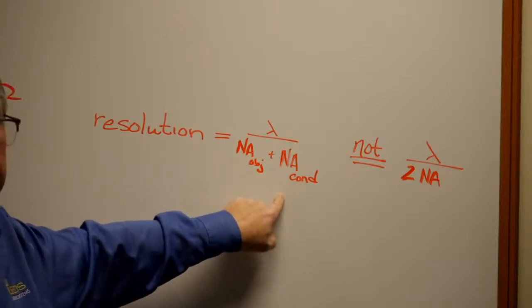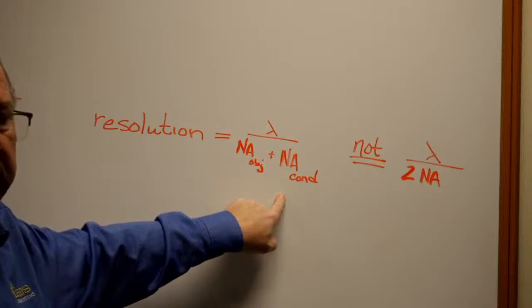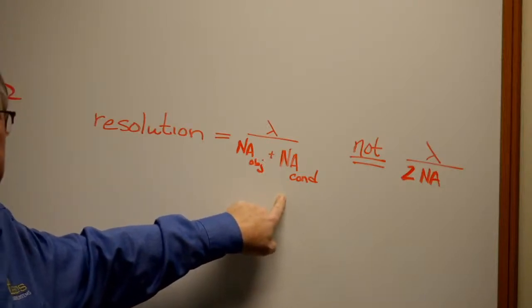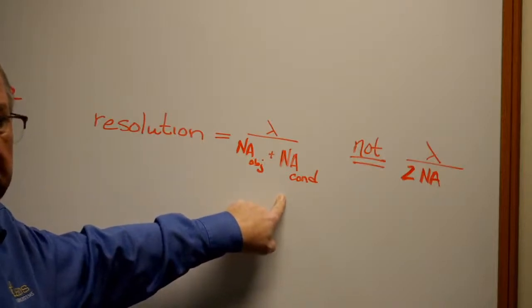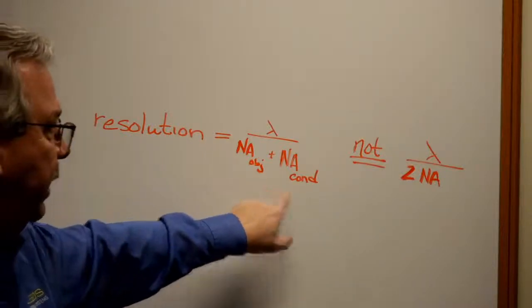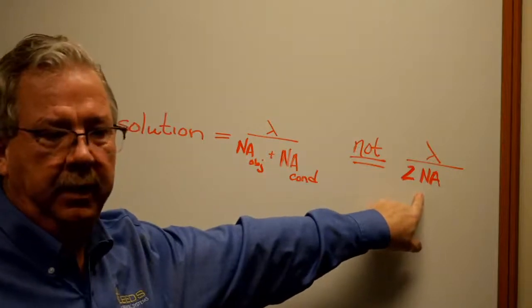Your condenser, or the angle of the light coming into the objective and controlling the angle of that light, is one of the ways that we achieve additional contrast and additional depth. This formula gives you the understanding for that. This formula assumes that you're not smart enough to figure all that out.